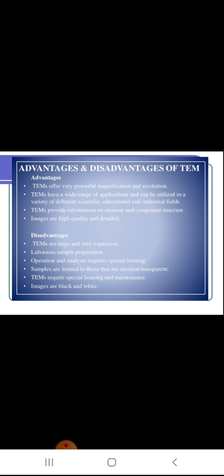A 1 lakh volt electron beam is focused on the section and manipulated by magnetic lenses. A photograph prepared from the image may be enlarged with enough resolution to achieve a magnification of 5 lakh to 10 lakh times at 1 nanometer resolution.